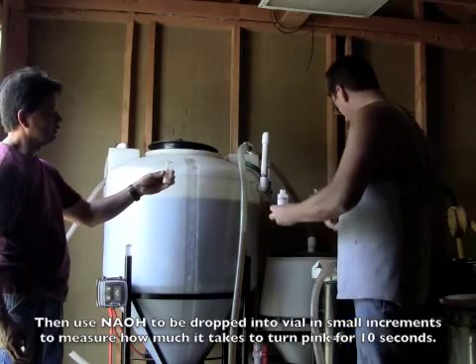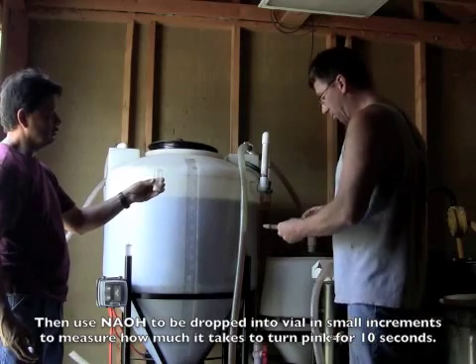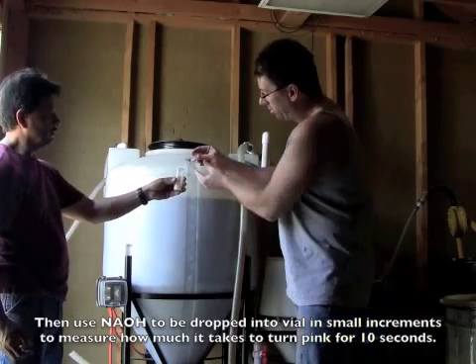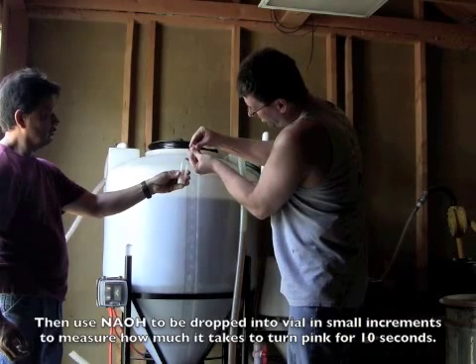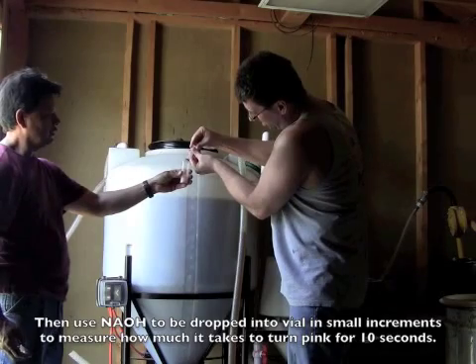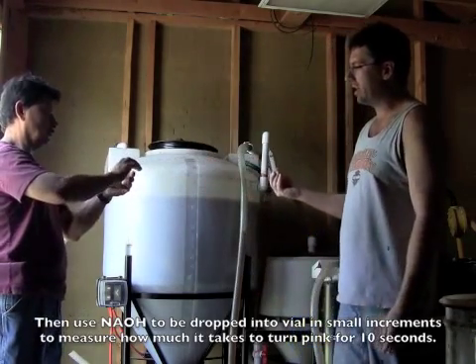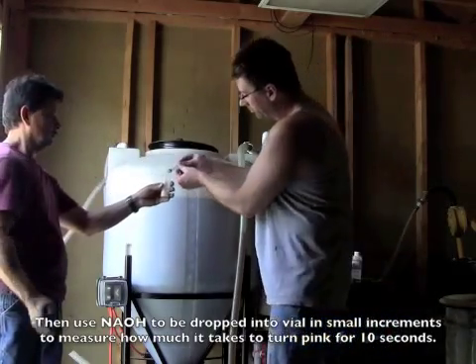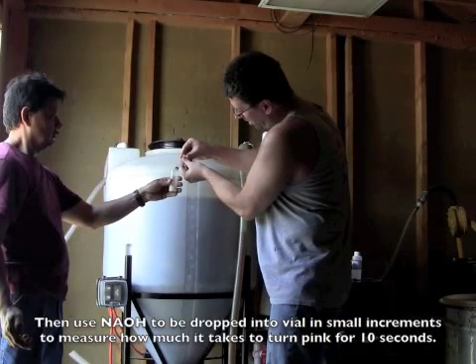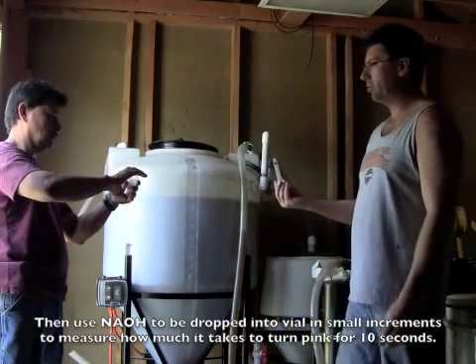Here's two milliliters drawn out. I bet it's going to just take one — that's what they usually do. We're adding it — there's 0.8 milliliters — shaking that up, but it's not going to be enough. There's one milliliter now, and that's still not enough.